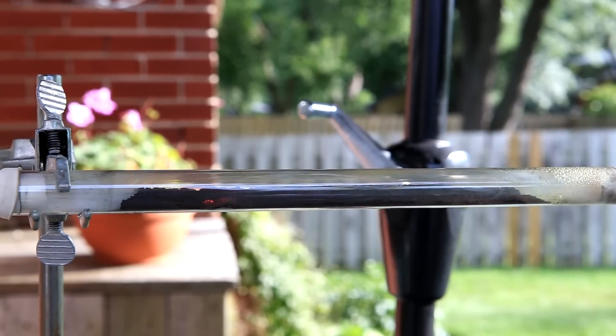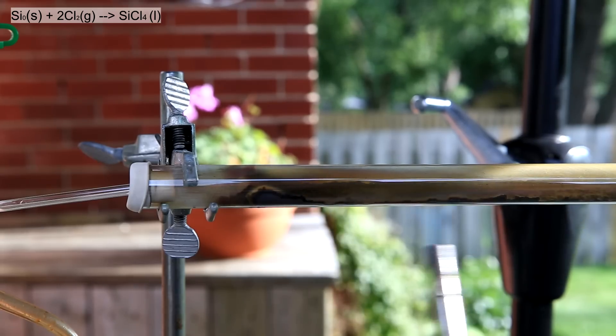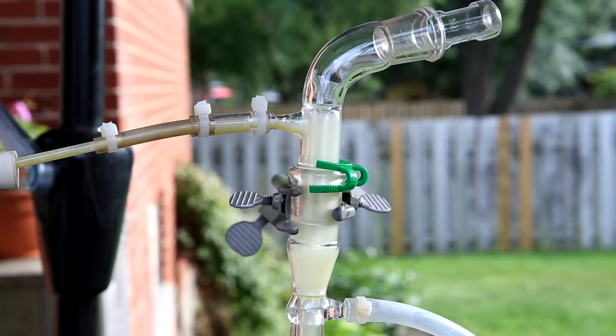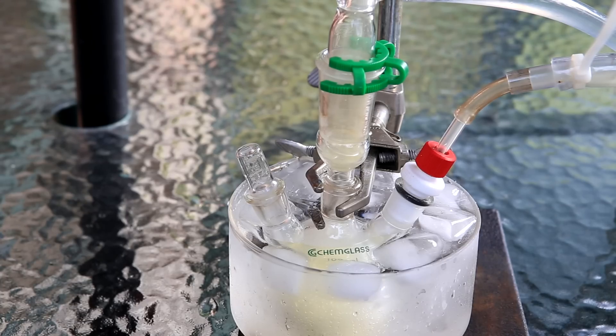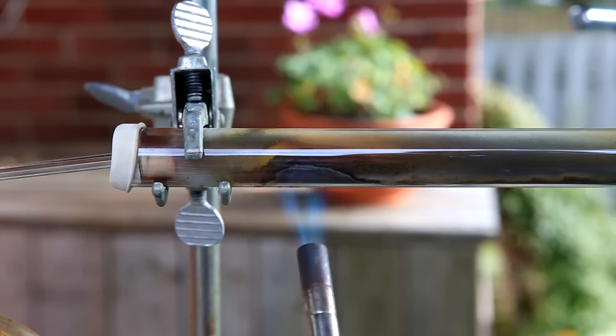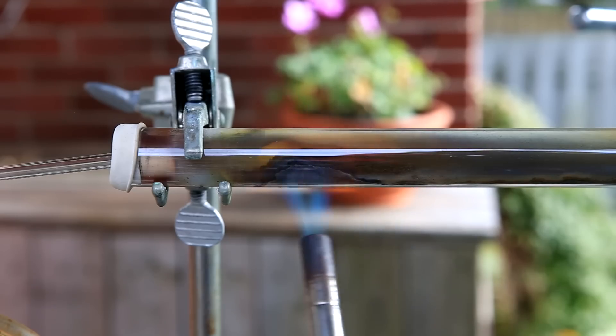You can see the silicon start to glow red and a white vapor come off — this is the production of our silicon tetrachloride. The reaction isn't too spectacular; basically the silicon reacts with the chlorine to form silicon tetrachloride. You can see the vapor coming down towards the condenser. Unlike what I did, I highly recommend using ice water for your condenser column because some vapor still makes it past the column. I keep heating the silicon but my flow of chlorine is quite slow so you don't see it glowing red too much.